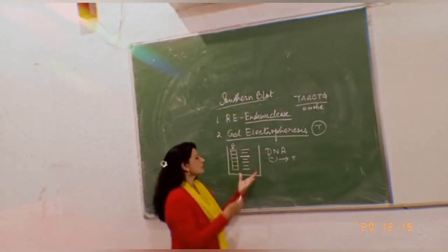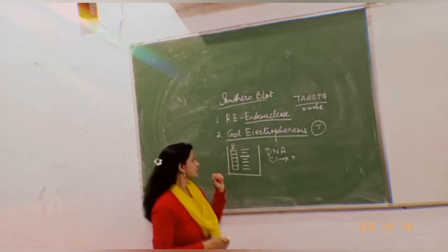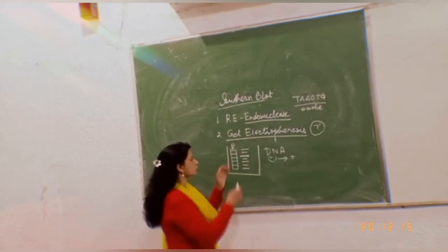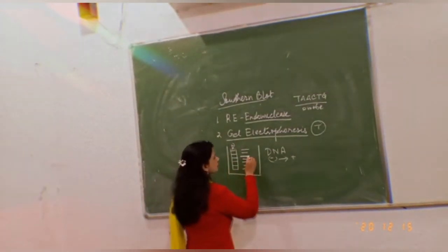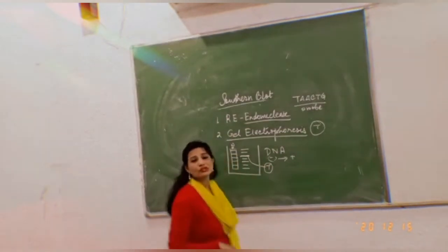Why? Because first of all, it is quite invisible, and it is very difficult. And then, thinking about the resolution of the band, I will not be able to locate my target DNA sequence. This is my target, but I do not know whether it is there or not.